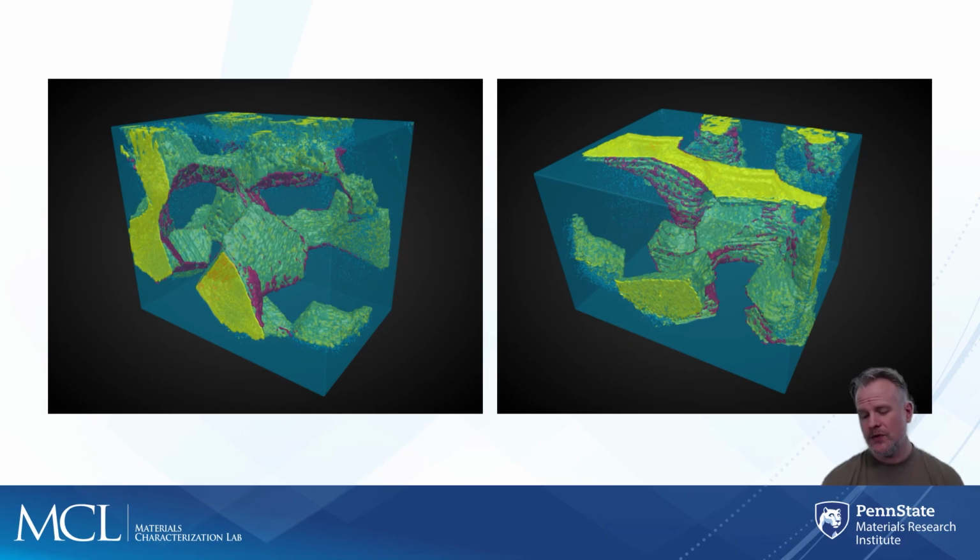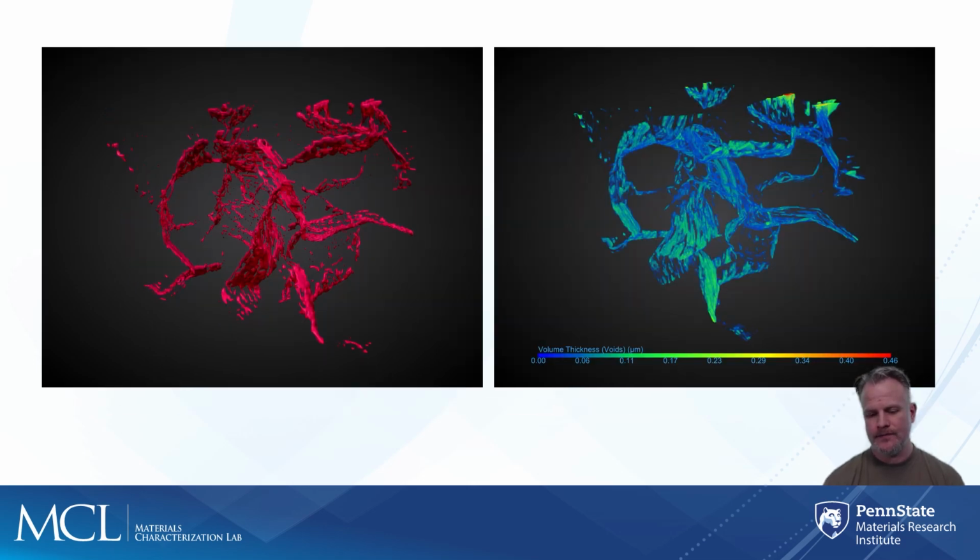This, while useful, doesn't actually tell you how these voids are behaving in terms of change in volume. For that, I can get a volume map, which is similar to the thickness heat maps and distance maps, except in this case we're operating in 3 dimensions. I can see that this lobe here and this top section of the grain are the biggest violators. That's where these voids are really starting to get aggressive and could potentially cause problems in this lead network.